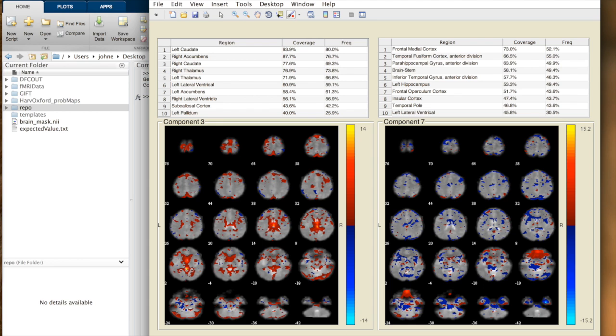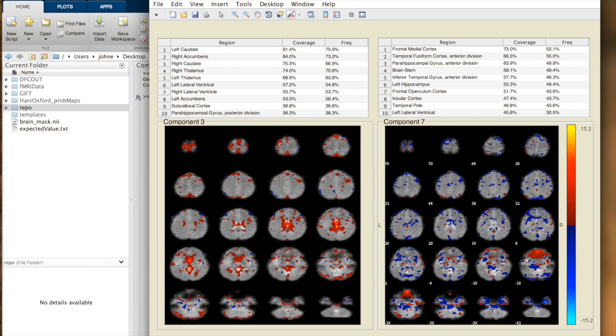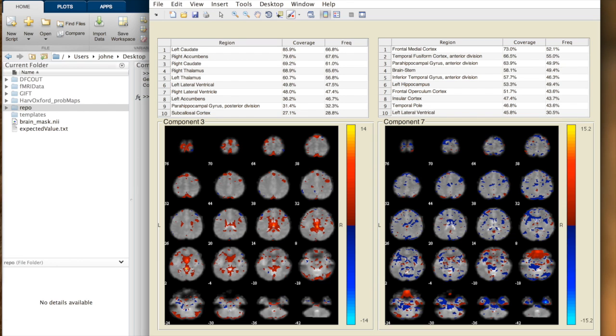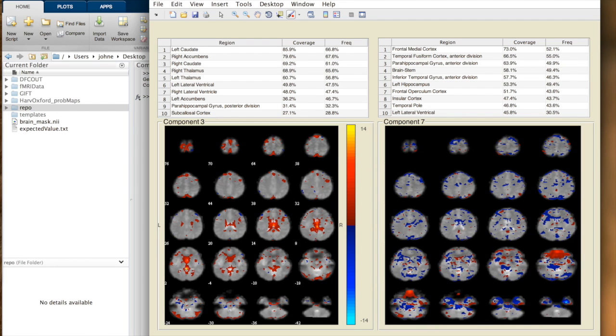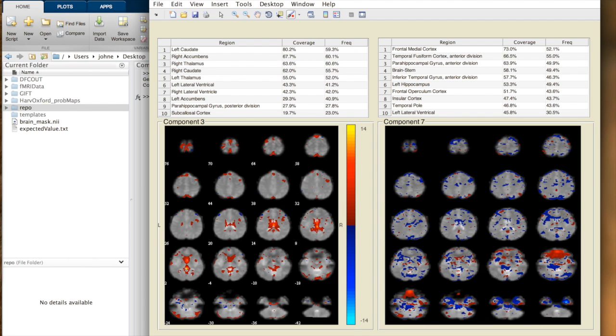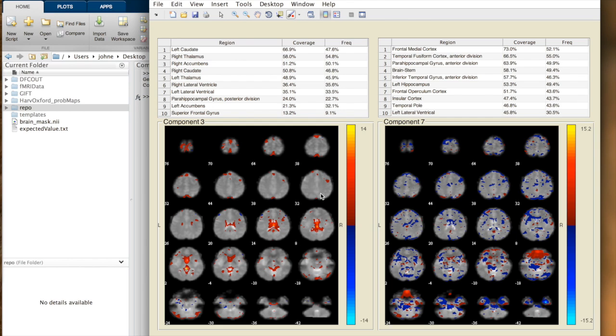We can increase the z-score cutoff, which means we see even further extremities of the z-score data. If we were to increase this, you can see some of these small points go away, because we're getting rid of more of the centered data.